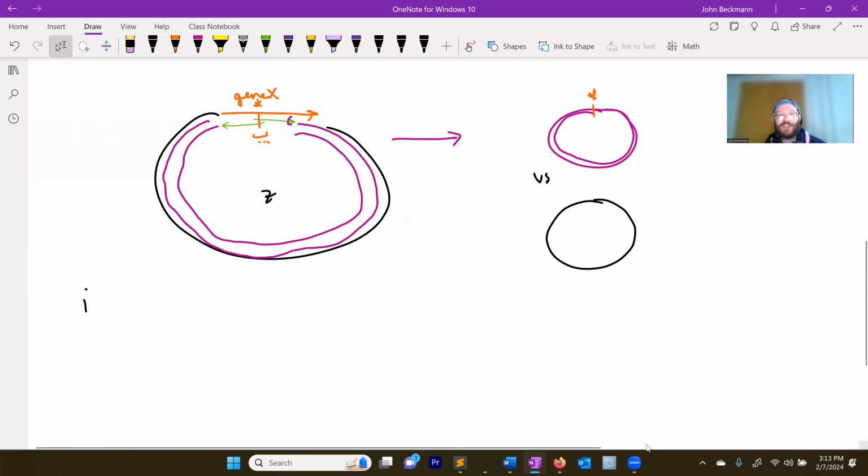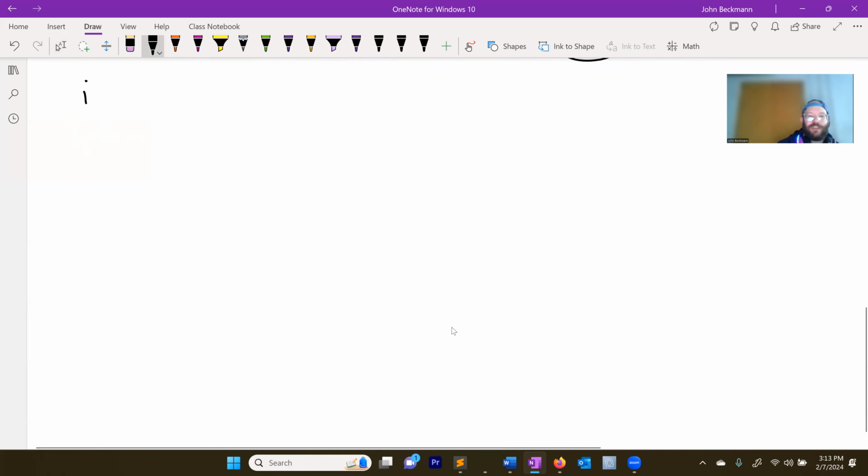Okay, so the question is, how does making a new plasmid with a mutation enhance some protein function? That's going to depend on the protein. Let me give you a more specific example. Let's say you had Tn5. Did Kyle, the guy who came in and gave a lecture, talk about Tn5, which is a transposon?